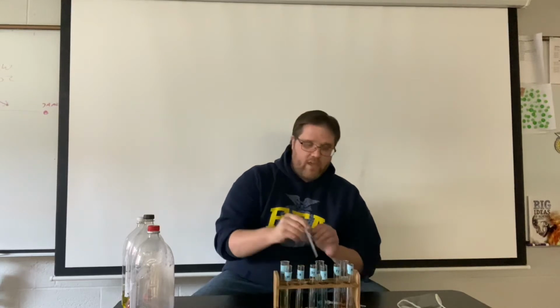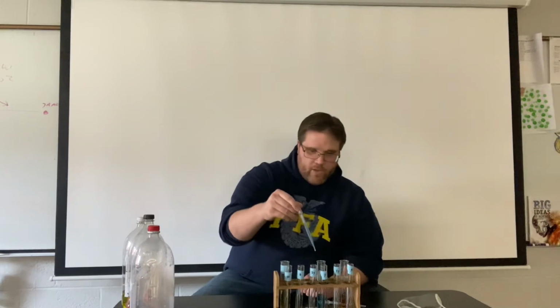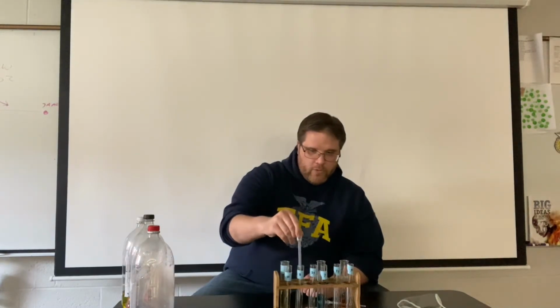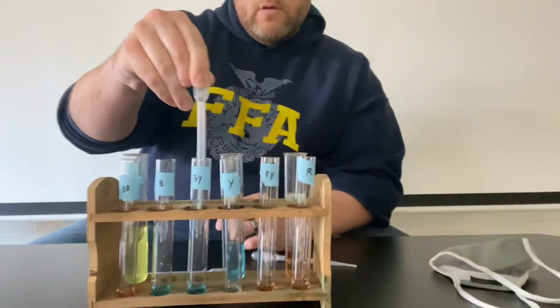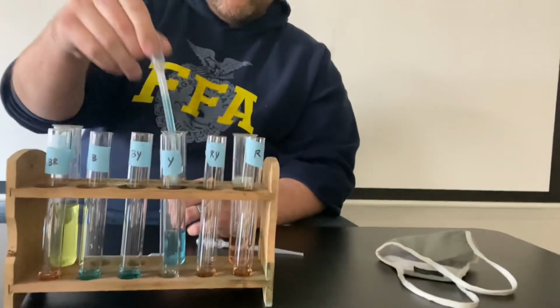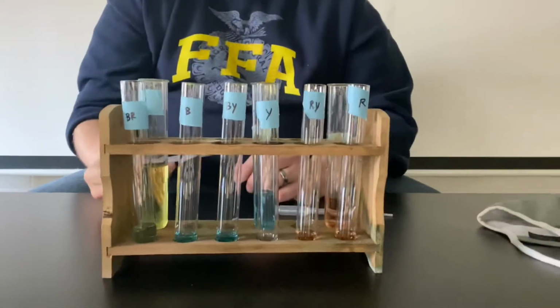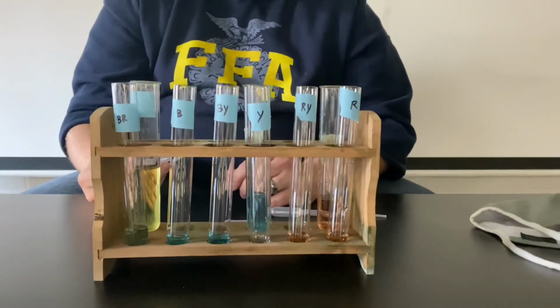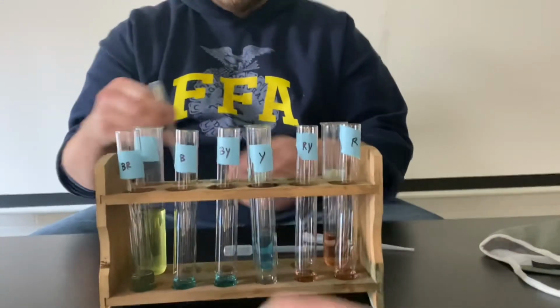I'm gonna get my next pipette. I'm gonna do blues. So when I do my blues, I'm gonna put it in blue. And then I'll go to blue, yellow. And then now I've got one that's gonna be mixed. So I'm gonna go blue, red. And what we should get is a color change. You should notice that when we're in light, it should look green, hopefully. Or I'm sorry, purple. So my apologies, I gotta know my own color theory here.